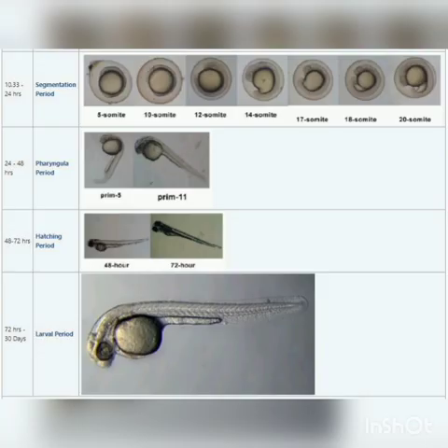Followed by that, we have the next stage called hatching. At this stage we see the completion of rapid morphogenesis of primary organ systems. Cartilage development will be seen in the head and pectoral fin, and the hatching occurs asynchronously, meaning it is not that all the eggs will hatch at the same time. They hatch at different points of time, and that is what we call asynchronous.